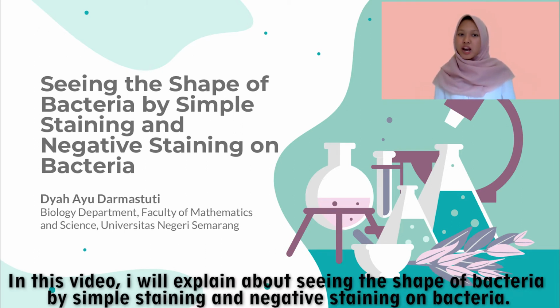In this video, I will explain about seeing the shape of bacteria by simple staining and negative staining on bacteria.